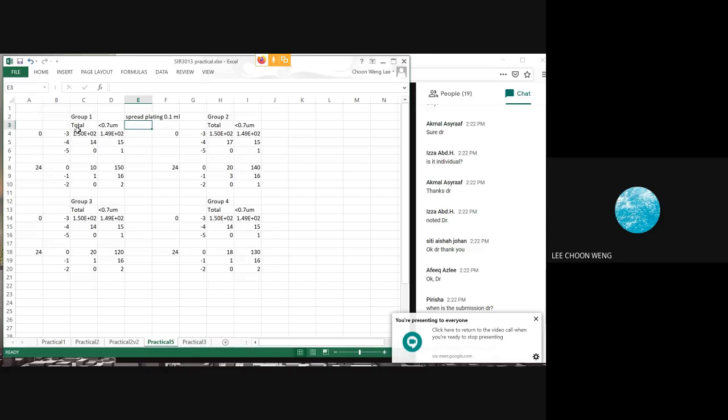the counts decreased for the total seawater, but although the counts also decreased in the less than 0.7 micron fraction, the decrease is not at as high a rate as the one in the total. So you will have two slopes.